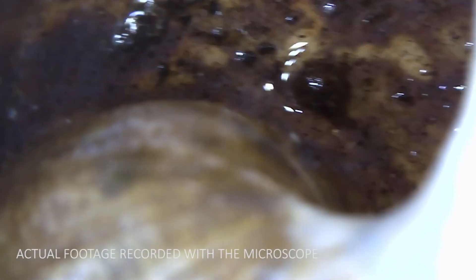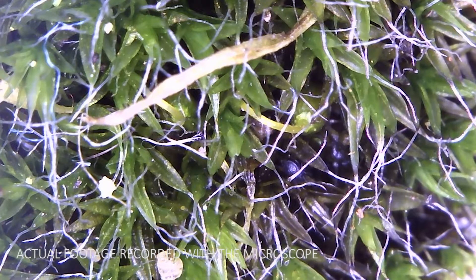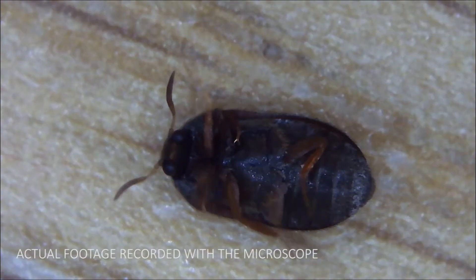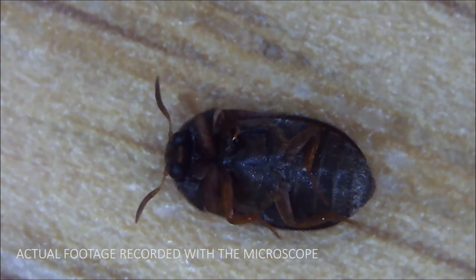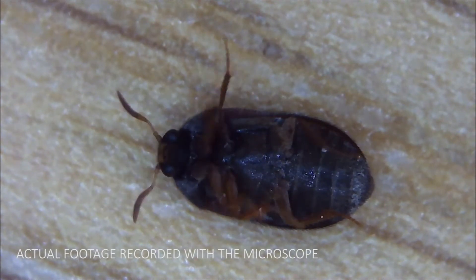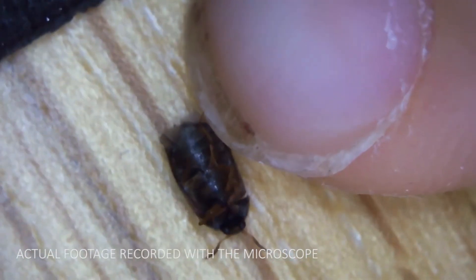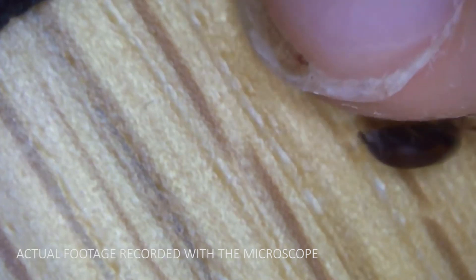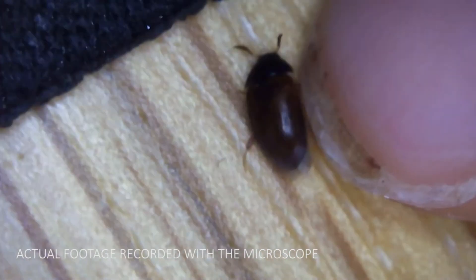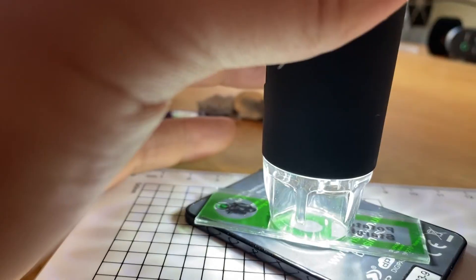Here's some actual footage taken with the microscope. This is a moss we found, and we didn't expect someone to be living in that moss — but there he is. It's a little bug. My son gave him the name Mr. Yucky Bug, and he crawled out as I was filming. Don't worry, no bugs were harmed in the making of this video — he escaped afterwards. The bug is extremely small: looking at the finger of my son next to it, he is literally maybe three to four millimeters in length. So if you're into collecting butterflies or exploring nature and insects, this is a really great tool.